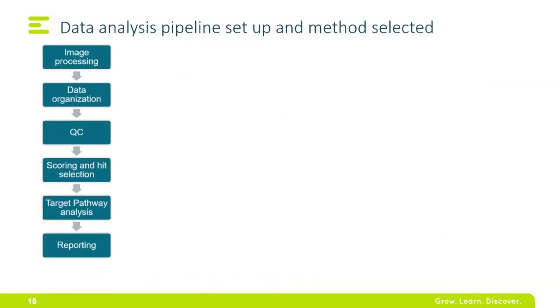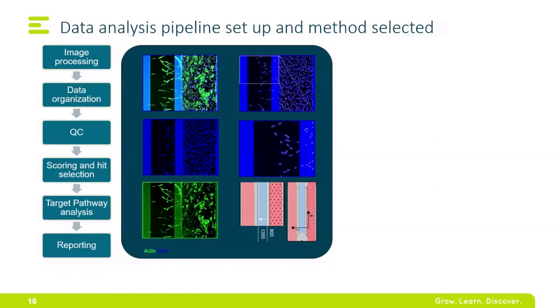So we started looking at whether we can do this in a high-throughput screening setup, and it was actually a very nice intellectual exercise. First of all, you need to make sure that you can automate your data capture, so that means the sprouting length, but also the frequency of the sprouts.